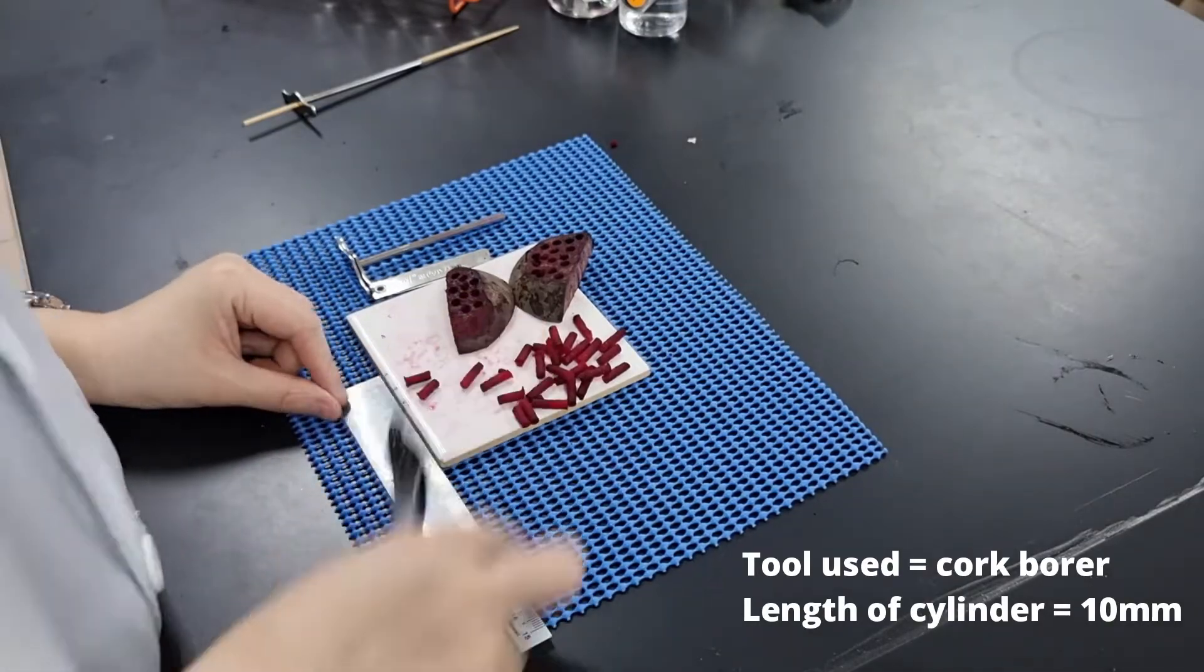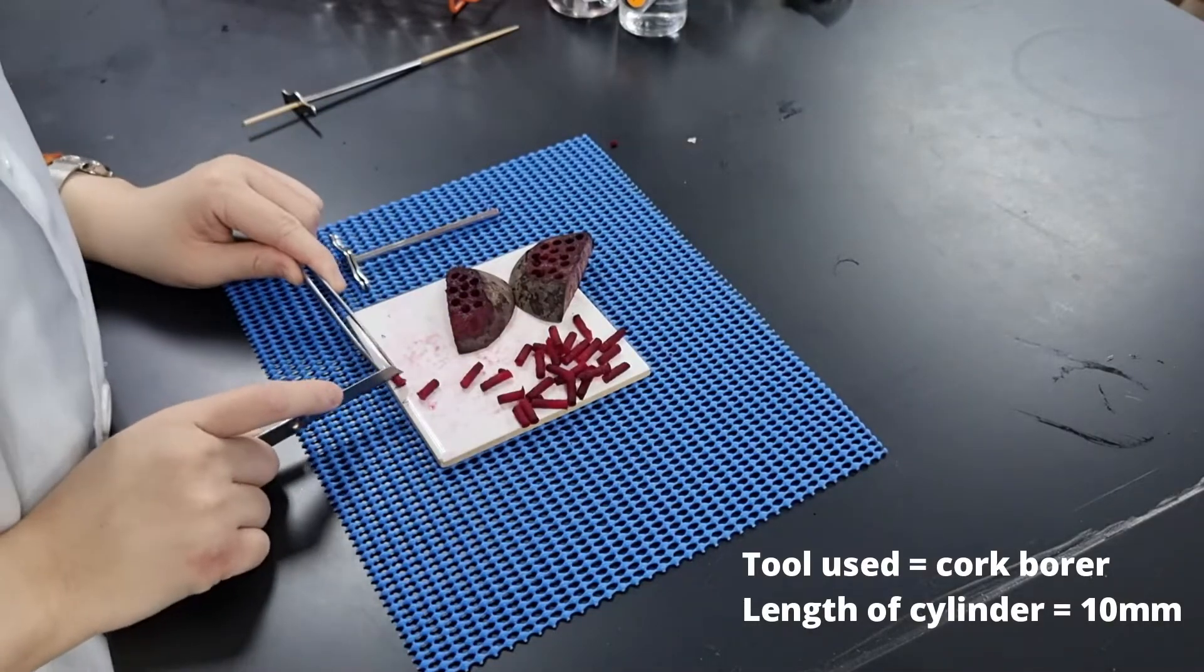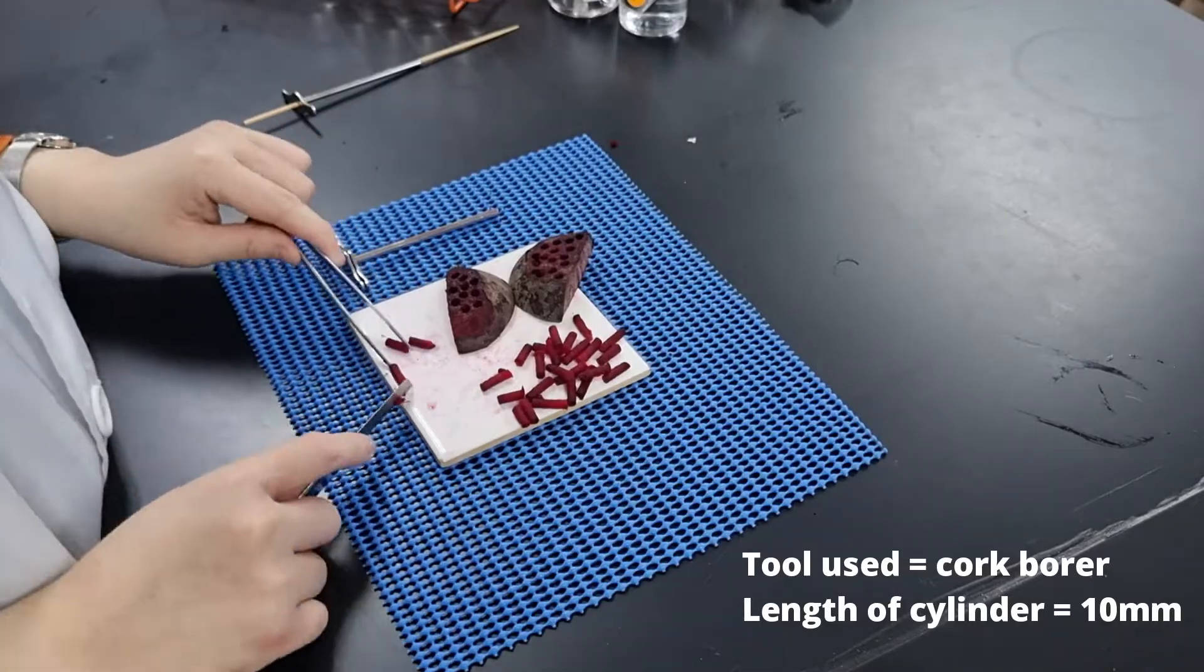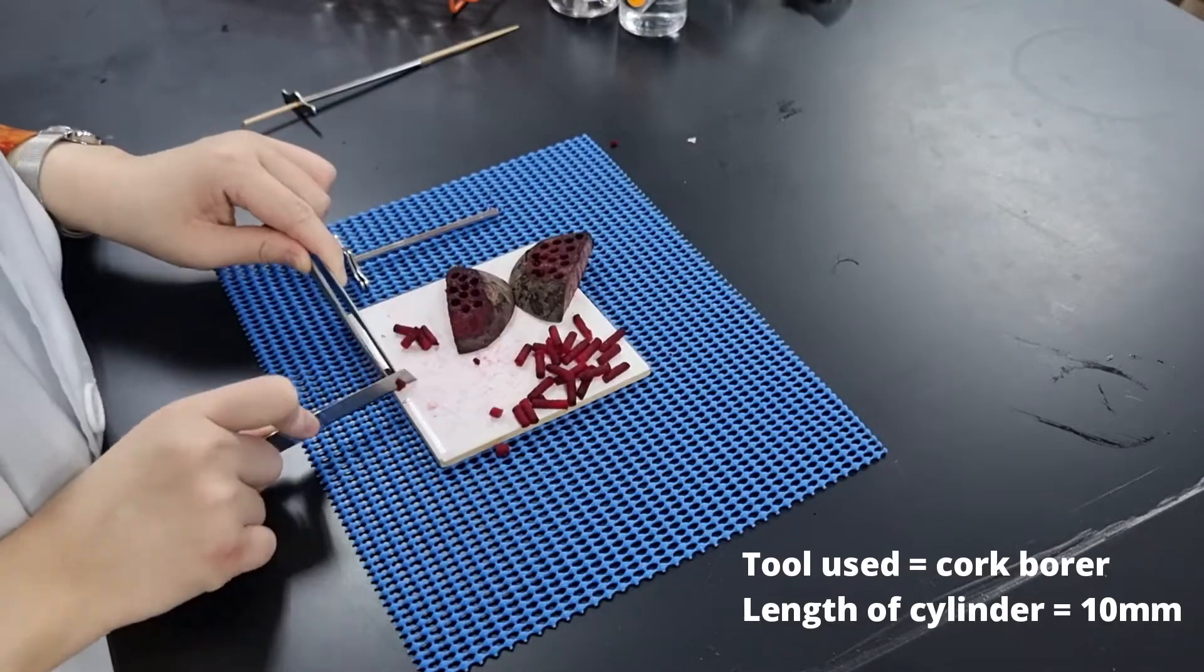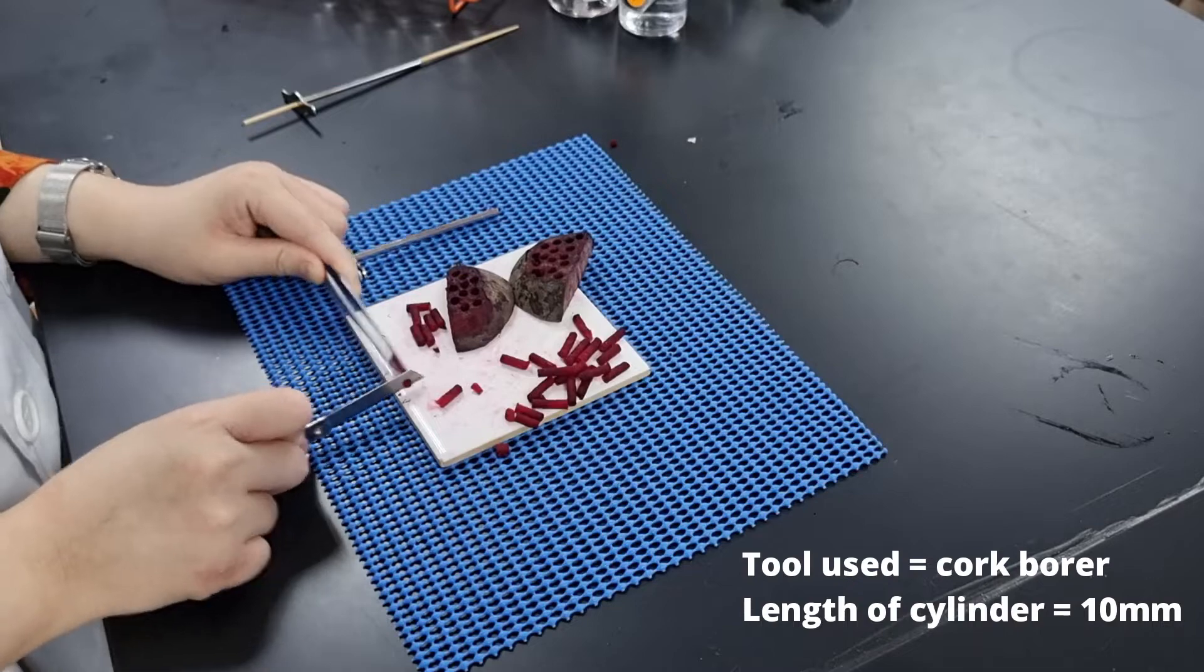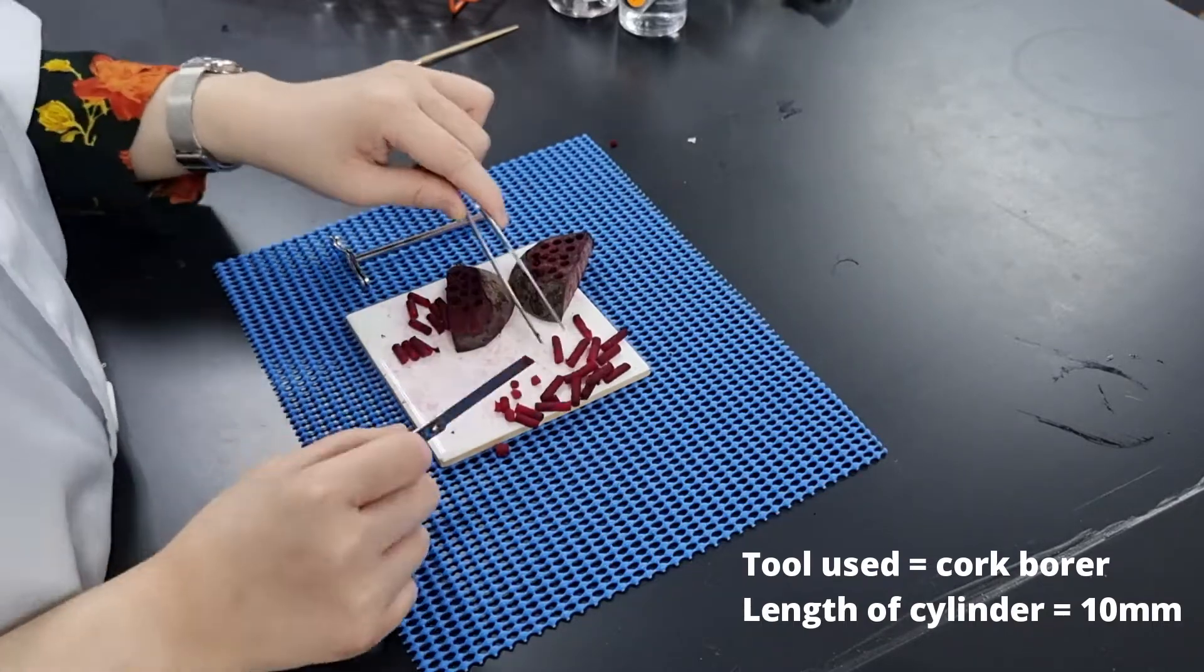We do that and we prepare five cylinders for each concentration. And since we have five concentrations, that means we have 25 beetroot cylinders to prepare in total.